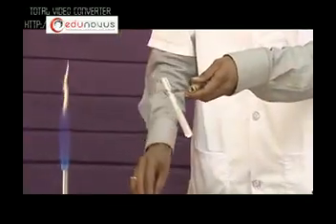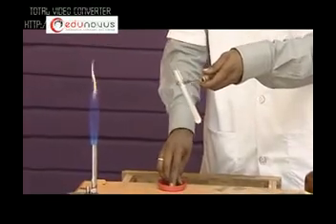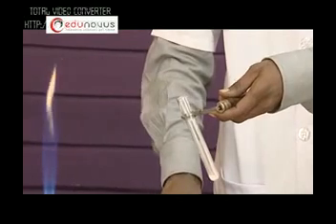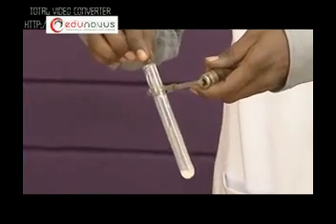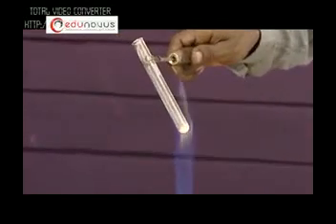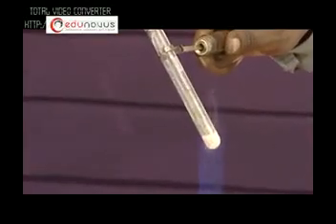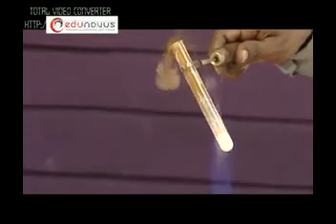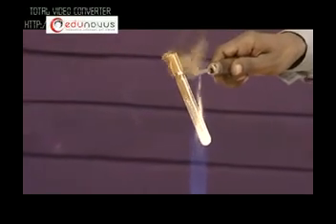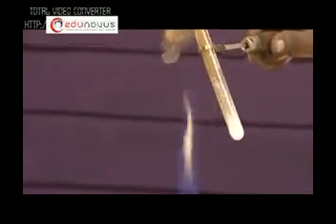And then we add copper turnings and finally we heat this mixture. Reddish-brown vapors are evolved and the solution in the bottom of the test tube turns blue.